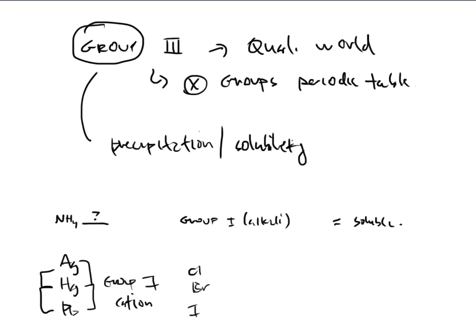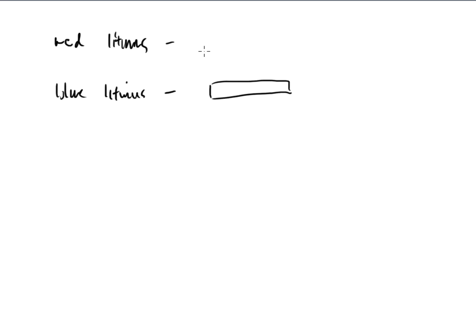The other thing that I want to say is this idea of going to acid or going to basic. All right, well, we have two different types of pH paper in the lab, and one is called red litmus and the other one is called blue litmus. So blue litmus is a piece of paper that is blue, and red litmus is a piece of paper that is red. All right, so that's not too difficult, is it? No, nobody said this had to be difficult, right? It makes common sense sometimes, so there we go.